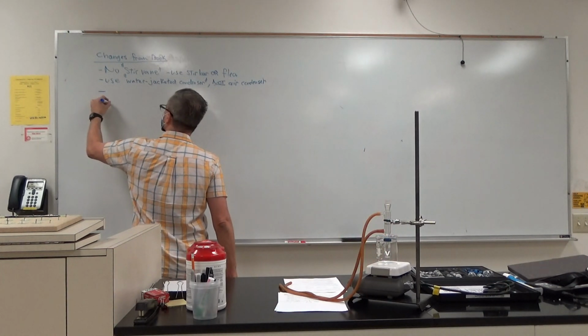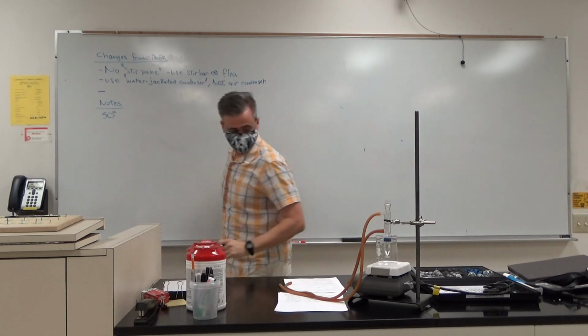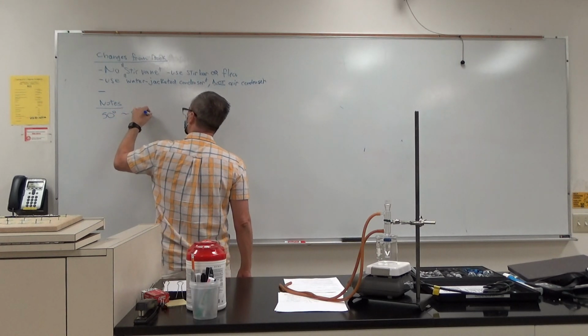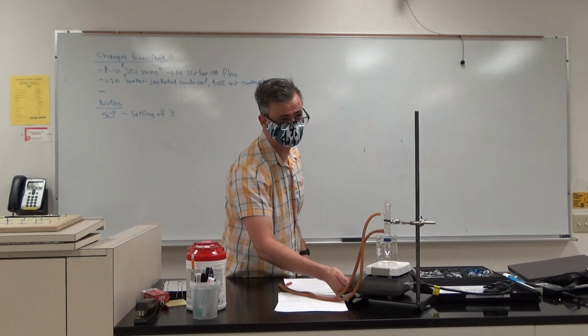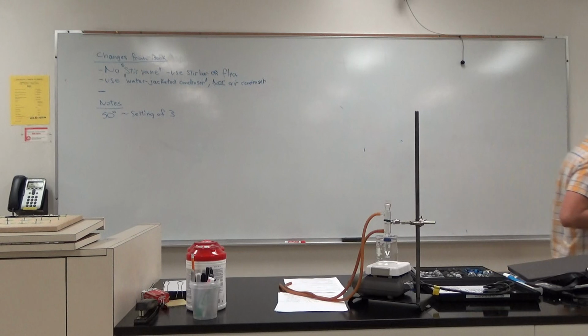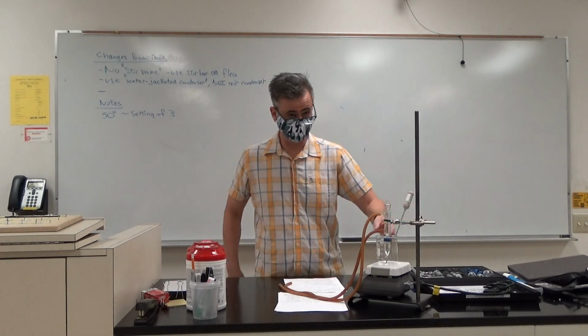So just some notes. You want your water bath at 50 degrees, which is around a setting, give or take, of 3 on your hot plate. Don't crank this thing up when the students get impatient and crank the heck out of it. Don't do that. Okay. You can monitor the temperature with these guys. So you can just stick this in there, all right, and monitor the temperature.